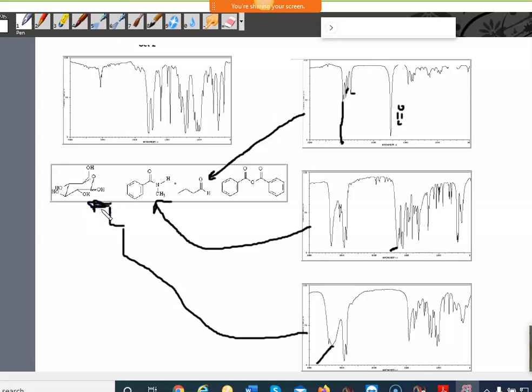And then obviously the last one's going to be anhydride, but here's 3000 right here. It looks like these peaks are just to the left of 3000, so that would mean just aromatic. And I definitely have a carbonyl peak. This is close to 1800. I got 17 and 18. So I definitely have a carbonyl peak there, so that would imply that one right there.